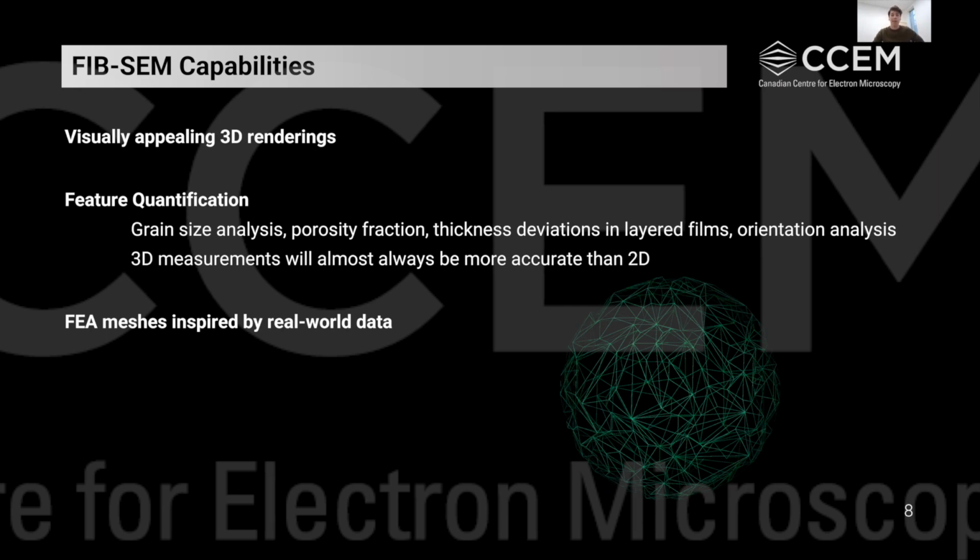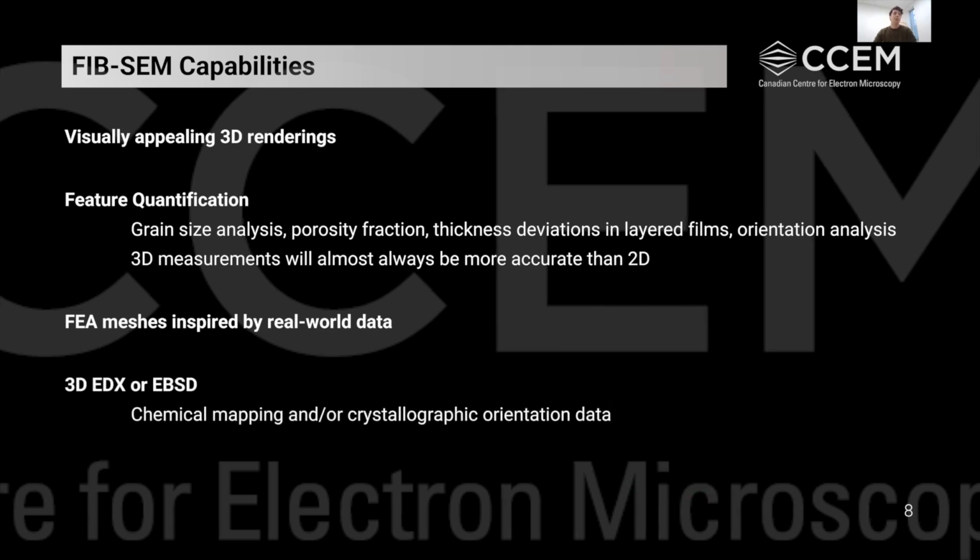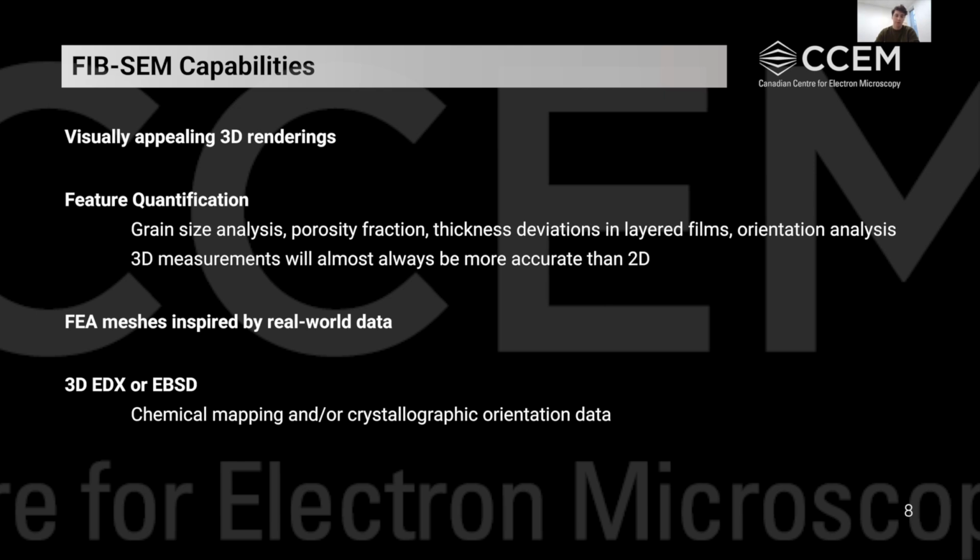Perhaps we want to generate FEA meshes that are inspired by real-world data. With an imaging volume of your sample, we can actually use that to inform things like grain size and porosity fraction that are important for your simulations. Or we can couple the 3D imaging with 3D EDX or EBSD techniques to actually get 3D maps of chemical composition or crystallographic orientation data.